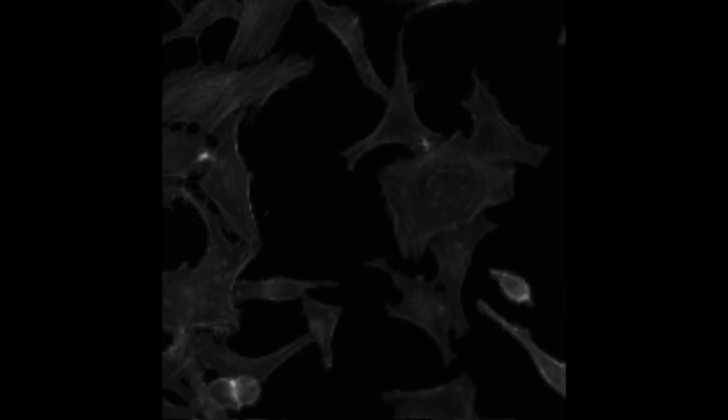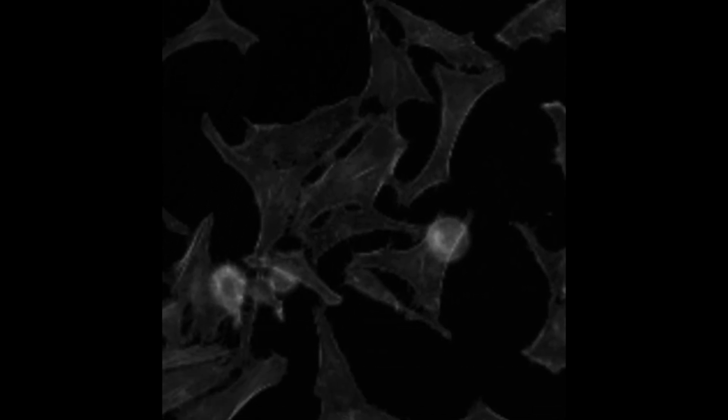And precisely how our workflow would look is basically we would transfect the cells, then we would wait for 24 to 48 hours, and at that point we would infect the cells and then wait for X amount of hours to image them. And the process on the microscopy side, which is probably the most interesting for Cytely, is basically like that. We would sit by the microscope, we would try to find cells that look somewhat interesting.